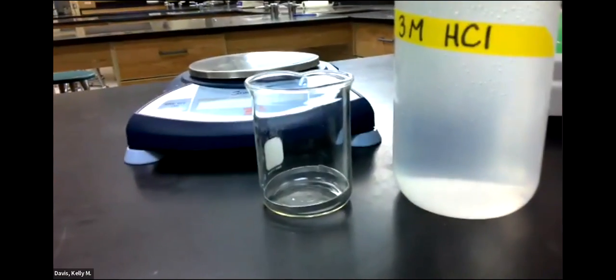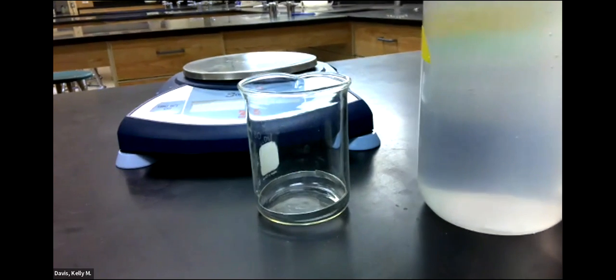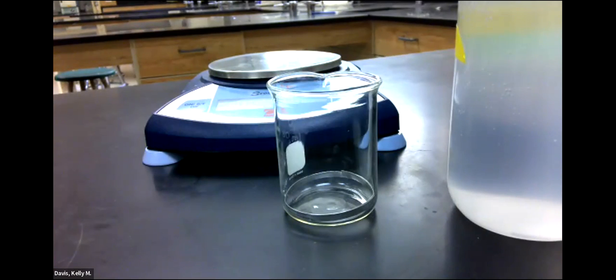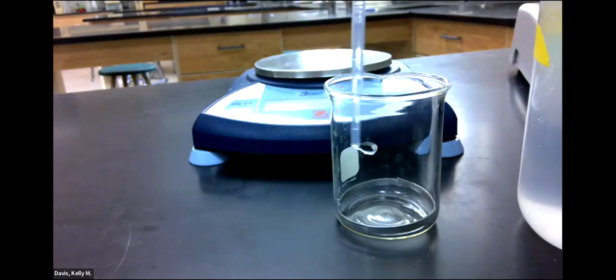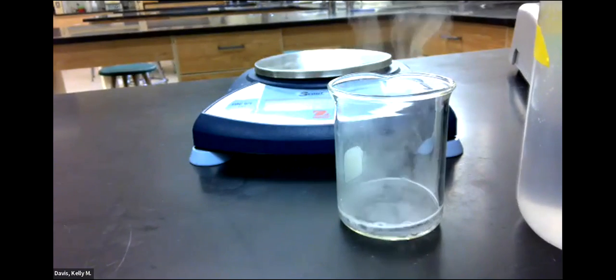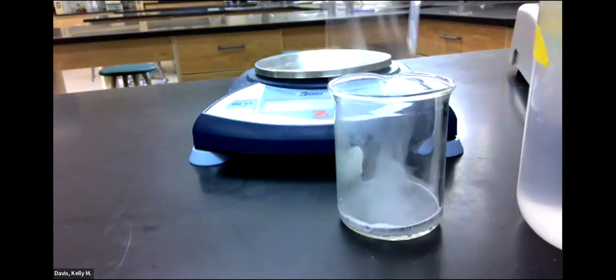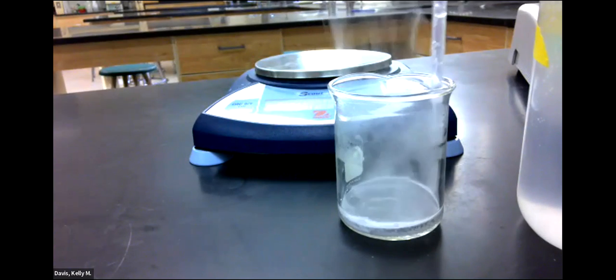Turn the camera on so you can see that. Let's see. There we go. That's better. And this is 3 molar hydrochloric acid. It's fairly concentrated, not the most concentrated, but quite concentrated. So you'll see what happens. It makes hydrogen gas. It steams a lot. It's pretty nasty. It smells pretty bad.